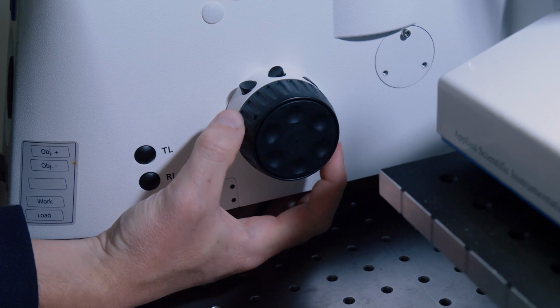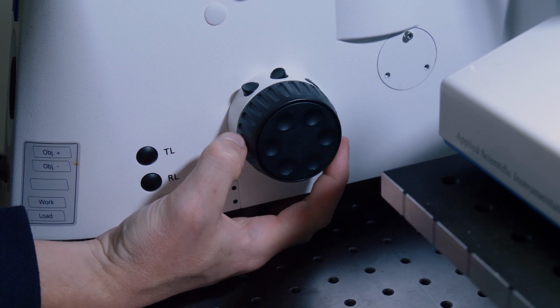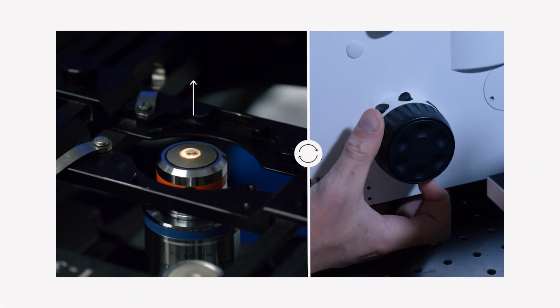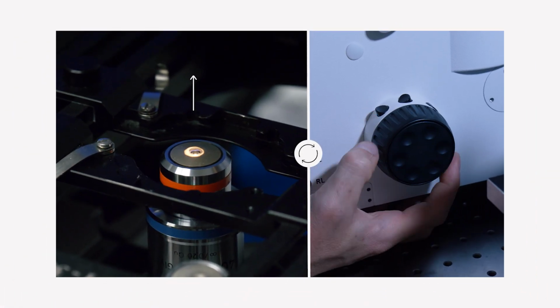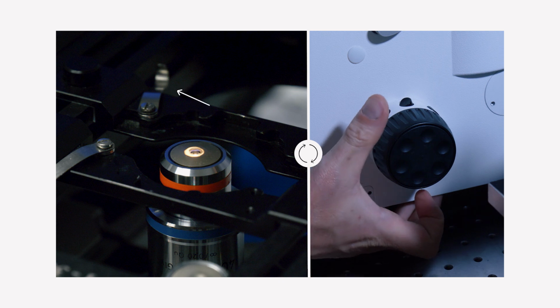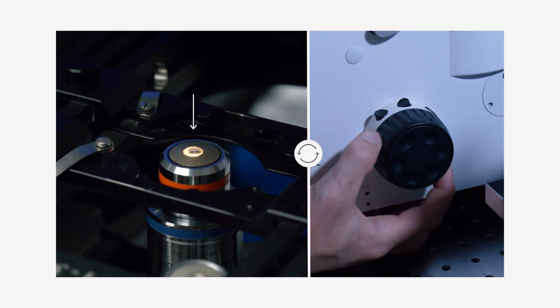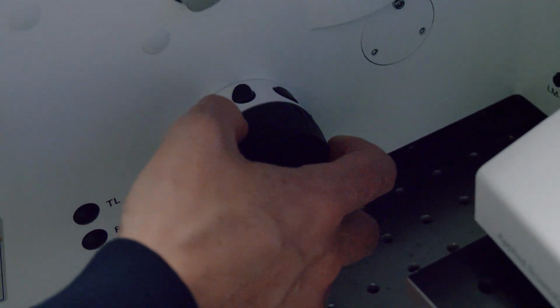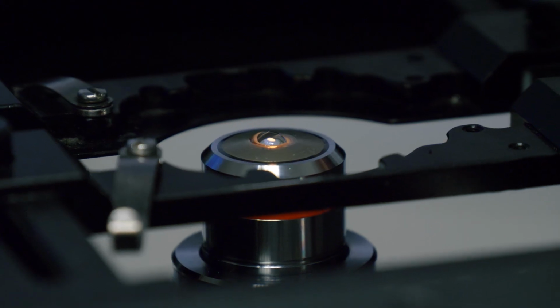Use the coarse focus adjustment knob located on the right side of the microscope to adjust the height of the objective. Turn clockwise towards the back of the microscope to raise the objective, and turn counterclockwise, so towards the front of the microscope, to lower the objective. Make sure that the objective is below the stage.